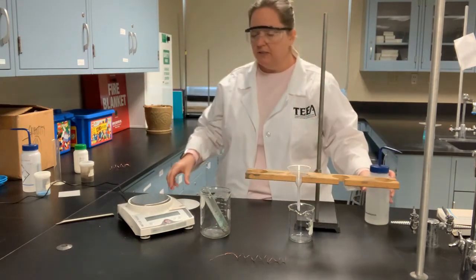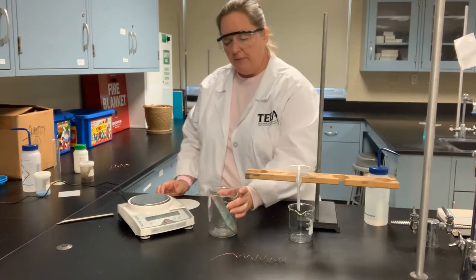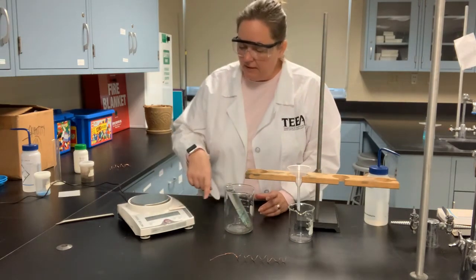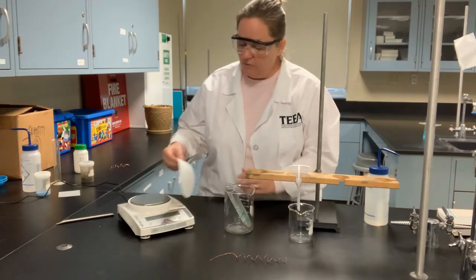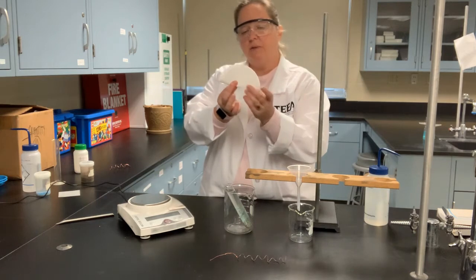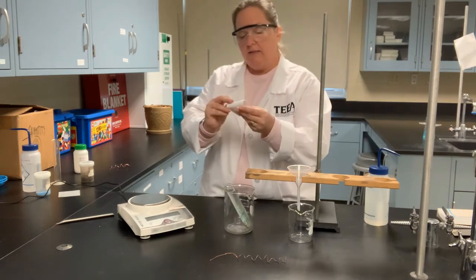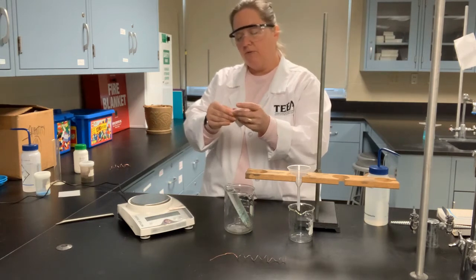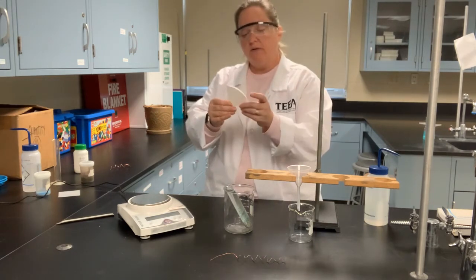So the next thing I'm going to need to do is weigh a piece of filter paper, which I have here. So my balance is on and it's zeroed out, and I'm going to go ahead and fold my filter paper just because this filter paper round is pretty large and it's actually a little bit bigger than the balance pan, so I want it to not hang over the edges so I get an accurate mass.